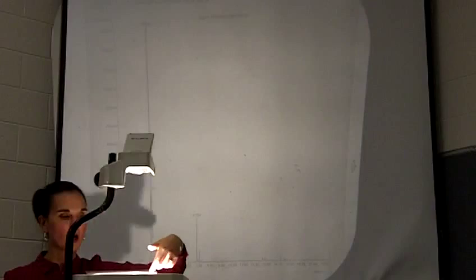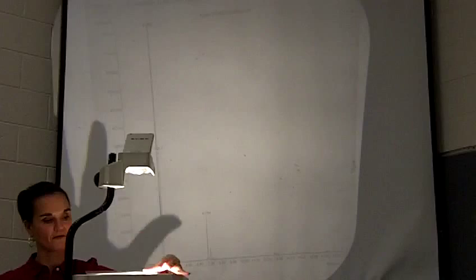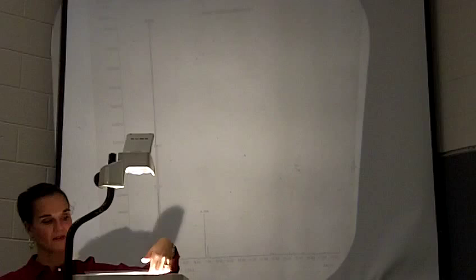So let me show you what comes out. This is the chromatogram. Okay, this is what was detected at this time, so we call them retention times. It draws these peaks to the relative height of response from the electrode. So these different peaks came off at these specific times in these relative amounts.